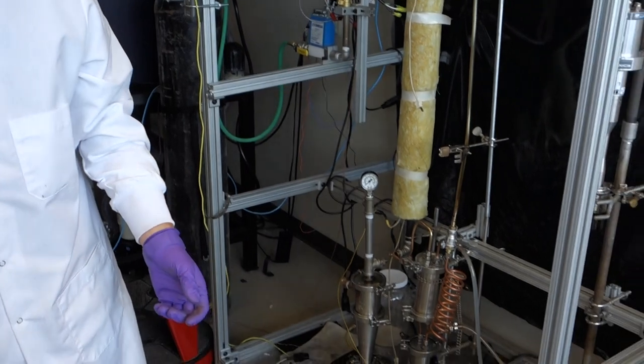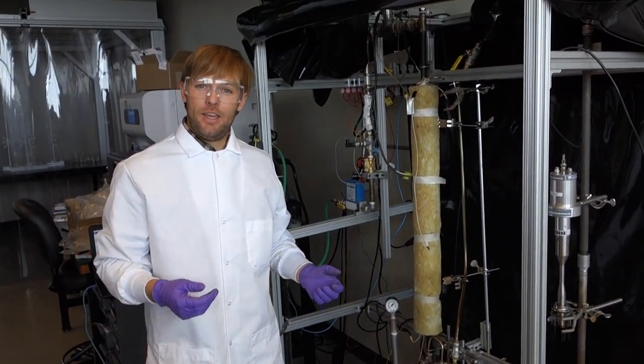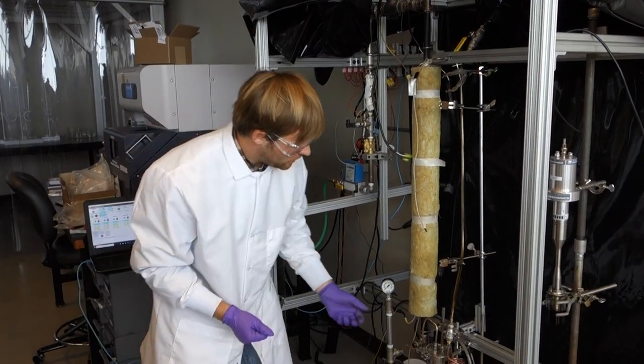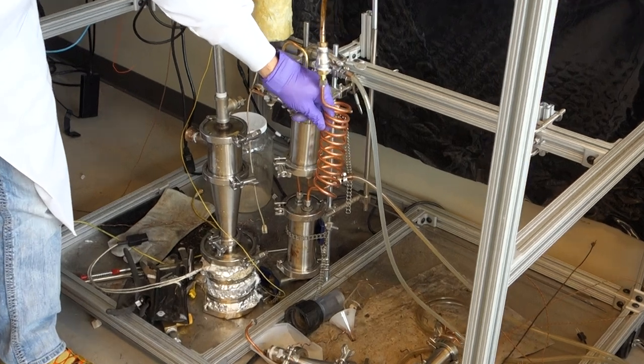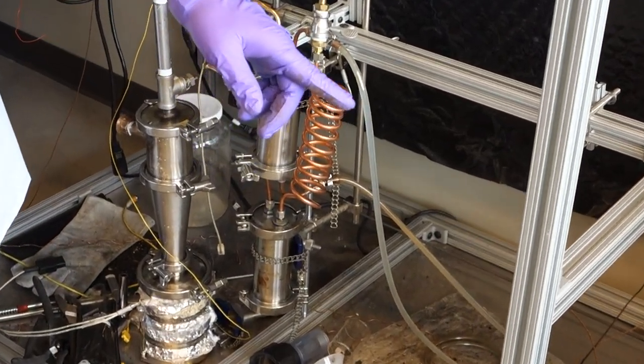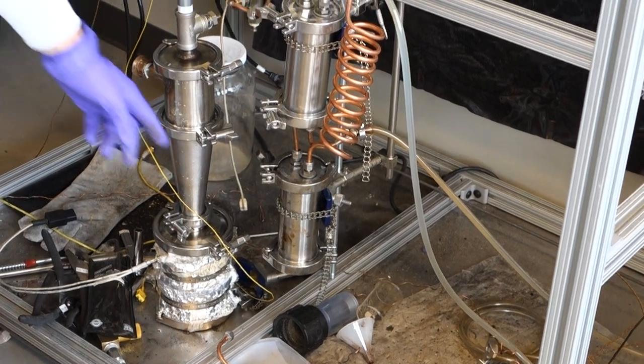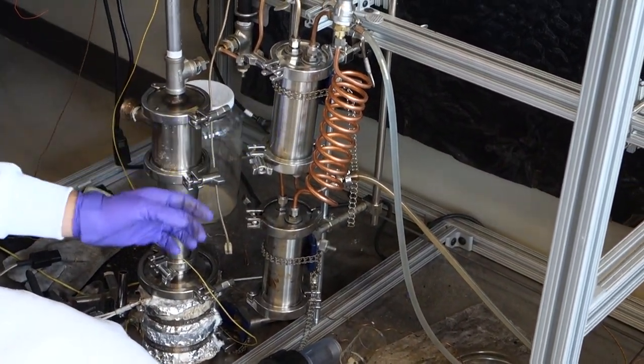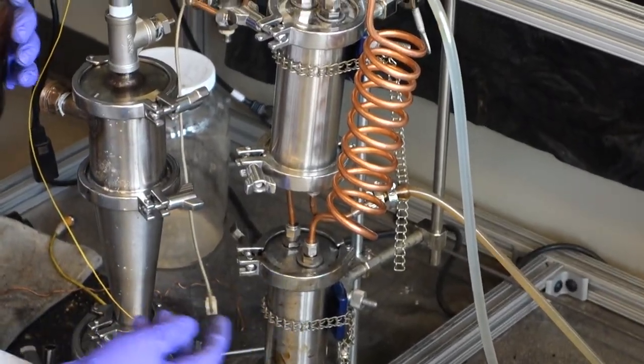It separates the charcoal from syngas and bio-oil vapors. The bio-oil vapors enter this condensation unit here, which is cooled with a chiller, and we collect the oil in this vessel. So this one's cooled, and then the excess oil we collect here.